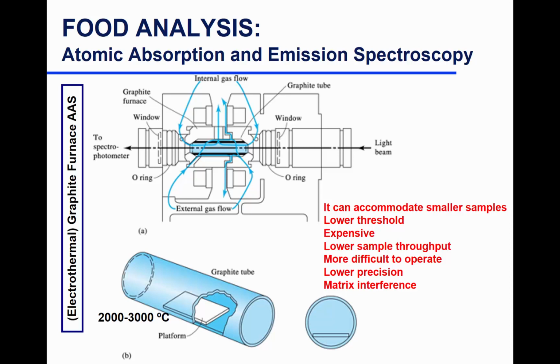But it's really more difficult to operate, given the complexity of the graphite tube and how you put the sample in. You need to wait until it cools between different samples in order to get the measurement.